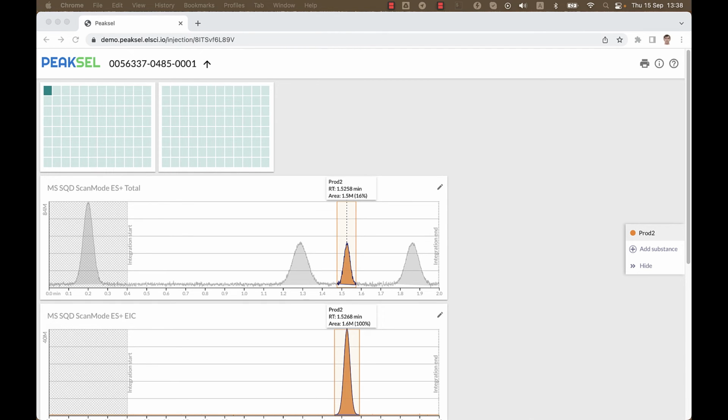Now, Apex Track, similar to other algorithms, has one major flaw. If on the same chromatogram you have peaks or regions of very different profiles, let's say some peaks are very wide and others are very spiky, it's hard or even impossible to ensure that both types of peaks have boundaries that we want. And if you have the same substance on many chromatograms, you may not like the idea of going through each of them and doing manual editing.